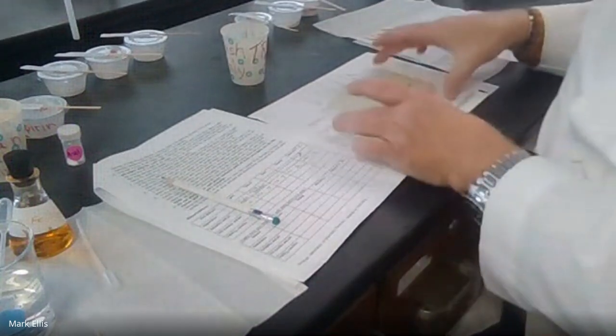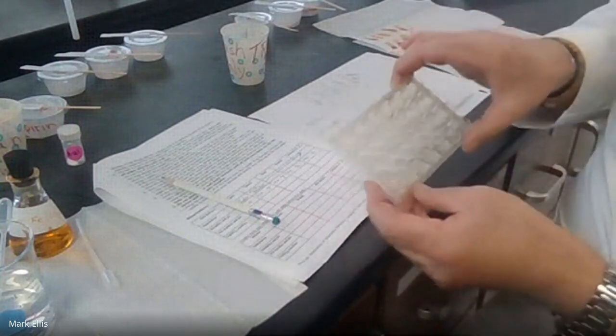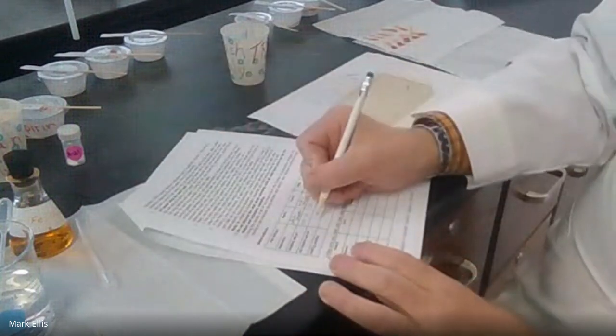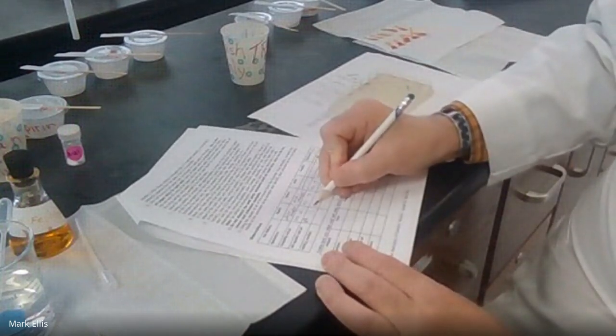So all these, reaction-wise, are still all insoluble. There were no color changes or bubbles, or at least no large amounts of bubbles. So pretty much no reaction, and I'll put NR for no reaction. And then the pH is 1 on all these, very dark red.